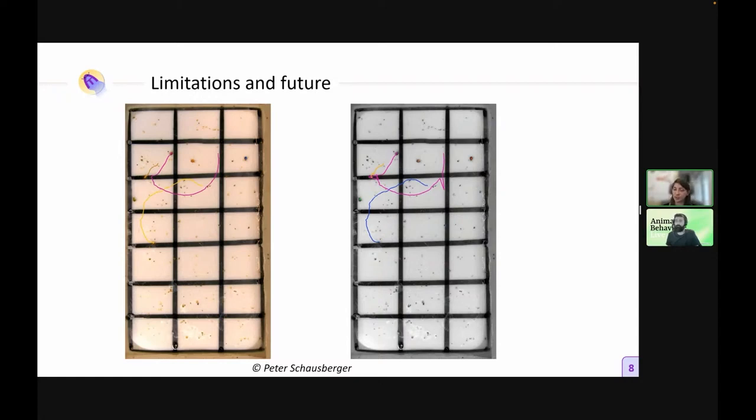But I know that there are very good tracking programs that propose that, like DeepLabCut, maybe SLEAP is doing that as well. There are other very good tracking programs that do that, but it's more complex and it's not inside AnimalTA's abilities for now. I believe the software we are receiving this afternoon, SLEAP, is also specialized in this kind of feature.